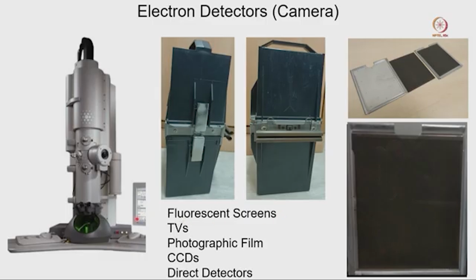Sometimes we were using the fluorescent screen, and a TV attached to this microscope so we could see those things. In this microscope now a computer is available, and that is the reason the computer is attached. But if you consider 20 years ago, how could we get those images, when computers were not easily available everywhere, right.